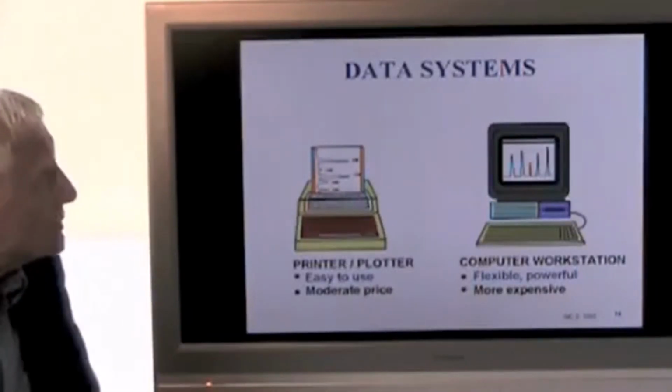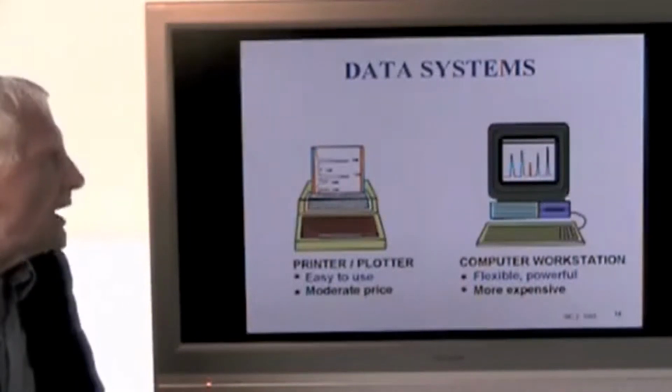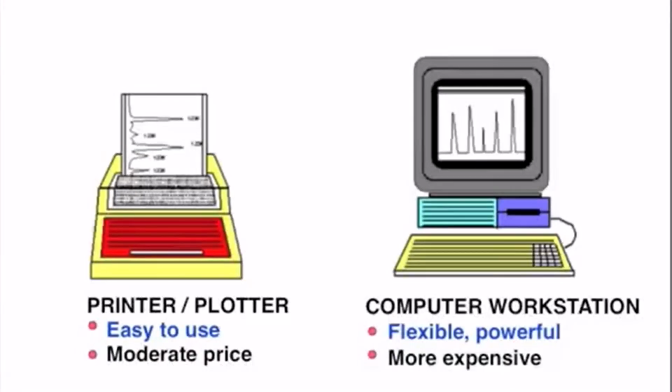The last point to discuss are data systems. Today, most data systems consist of a computer workstation. Typical price might be around $5,000, $7,000, depending a little bit on the software available. They are by far the most flexible, the most powerful, and also the most expensive.